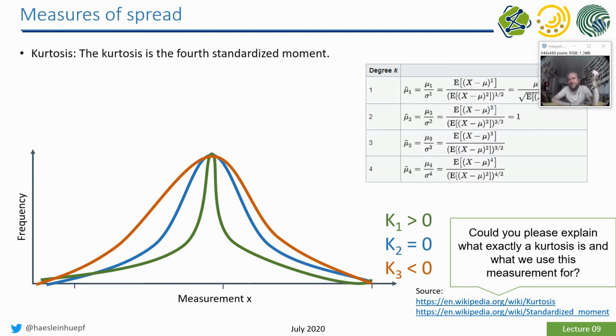But especially when you have big data, many cells imaged under different conditions, you may not observe a difference in the mean intensity of those cells, but you may observe a difference in the kurtosis of the distribution of the intensities of the cells. And if you see that, sometimes it really makes sense to have a look at skewness and kurtosis of distributions. If you observe that, then you have to look deeper into why the third and fourth moment are affected, and the first and second maybe not. So in special cases, it may make a lot of sense to analyze this kind of measurement from your original data.